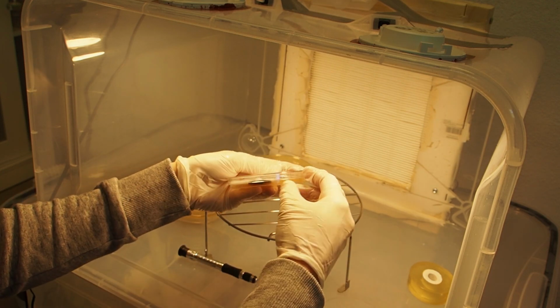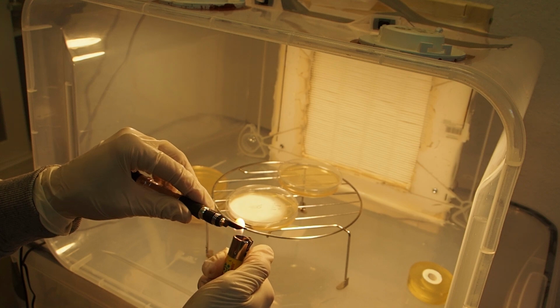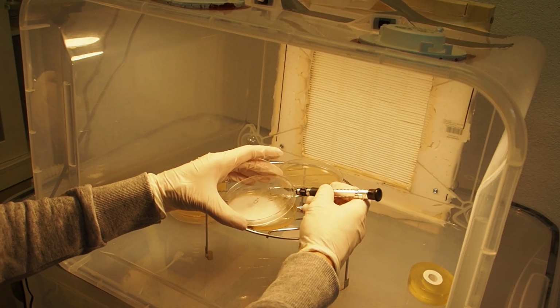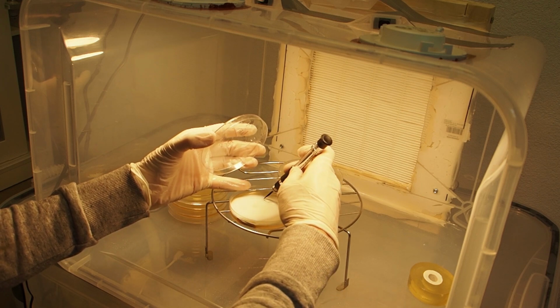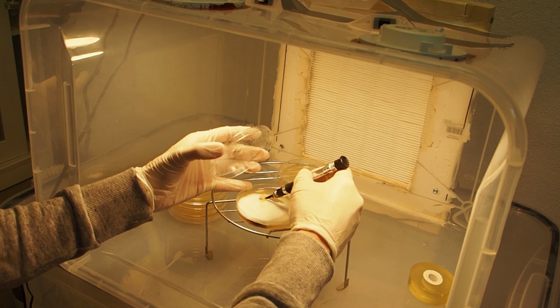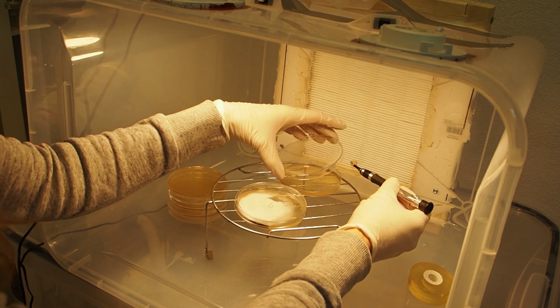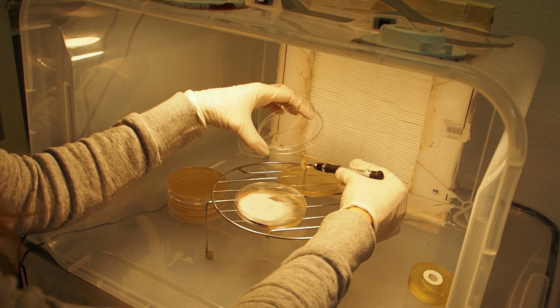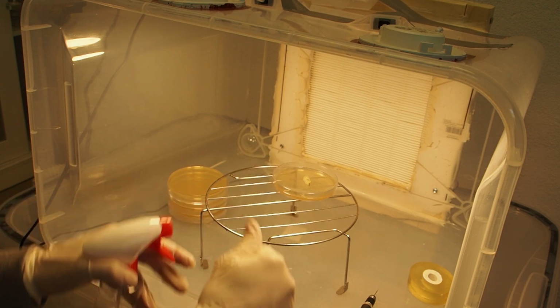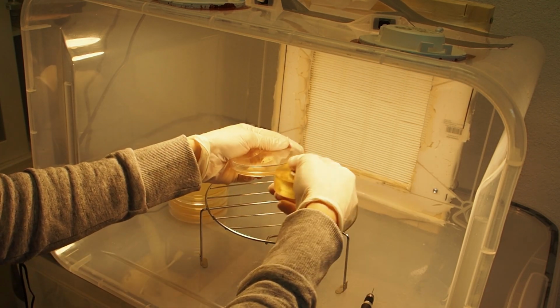Okay, now it's time to clone the enoki, which is contaminated. Let's do this. This time I want to give it two good reps instead of only one.